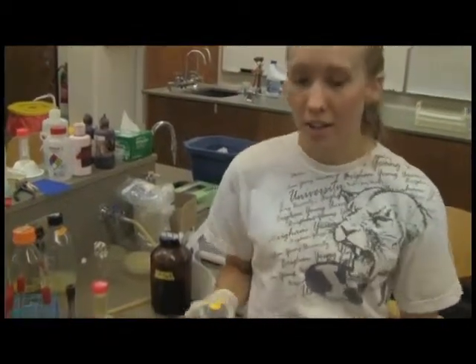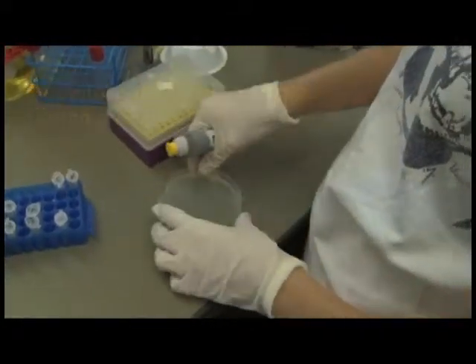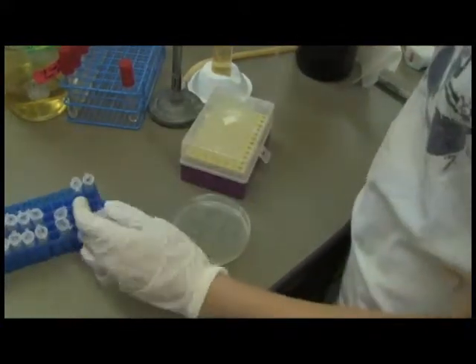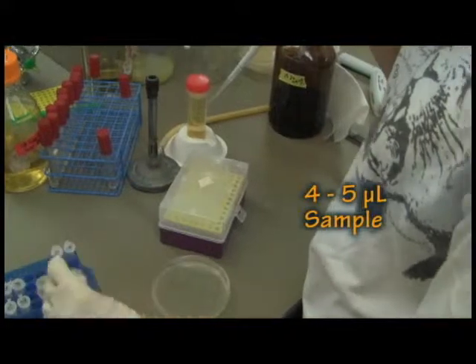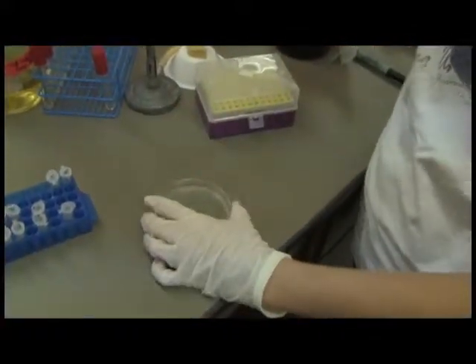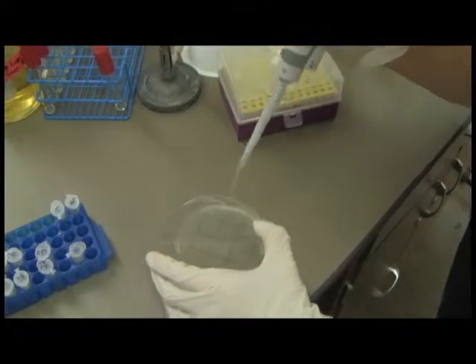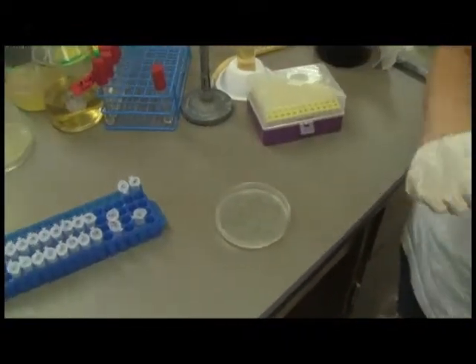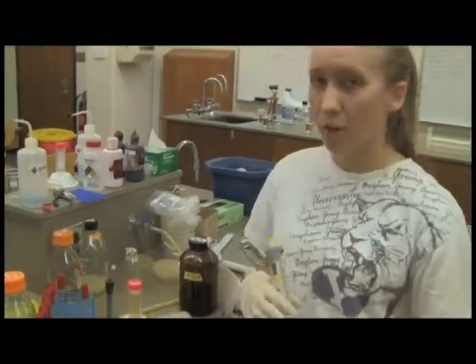To test whether or not we have phage in our sample, we'll do what's called a spot test. So we first draw a grid on the back of our plate, and we'll take some of the sample that we think has phage in it. We'll take just about 4 or 5 microliters, and we'll put it onto this plate that has only bacteria in it, no phage. And we'll just put a tiny little dot on there. And then we wait for it to sink in, because if you tip it over, then it will all go running, and it's not quite as pretty. So you just do this with every one of your different kinds of what you think has phage in it, and then if a plaque forms at the end, then you have phage.